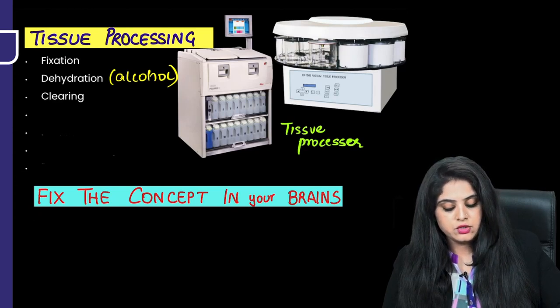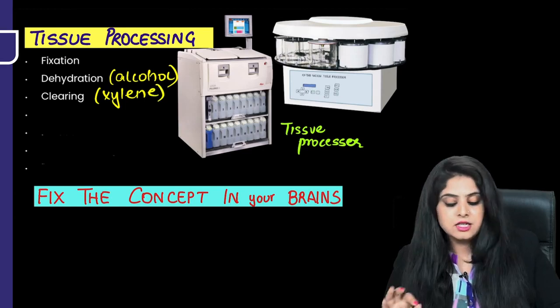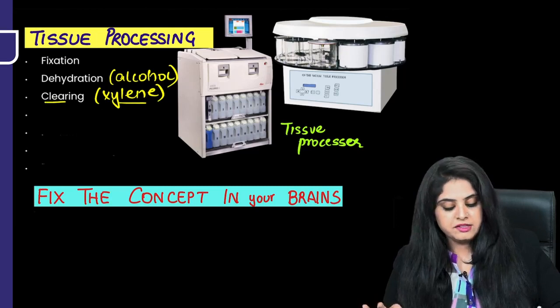In order to clear the tissue, we have chemicals called xylene. How have I learnt it? To clean, you have xylene. To clean, you have xylene. So simple. Fix the concept.